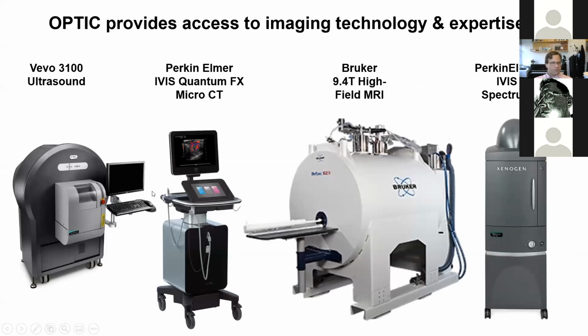I'm now going to switch over to small animal imaging technologies, of which our core facility has 4 that are established. As well, I forgot to mention this back on the first slide, our core facility also serves as a bridge to the PET center that's run by Akiva Mintz.